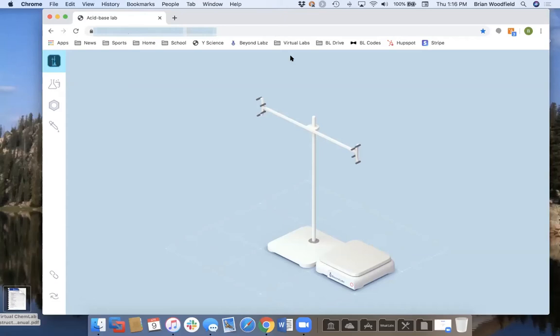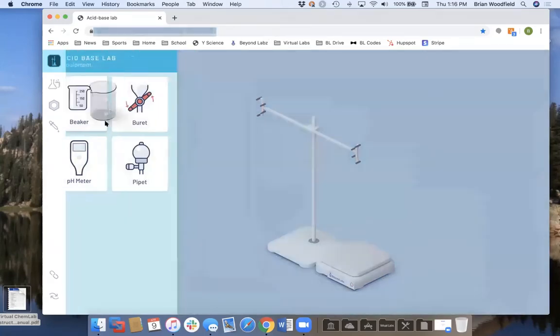And we were playing around because before all of this hit, we were exploring India, where there are lots of bandwidth issues. So we needed something lighter that was HTML5 that could work on a phone. So this is a prototype of what we would call a tablet or phone product. But I'll show you kind of how it works. It's still the same engine underneath.